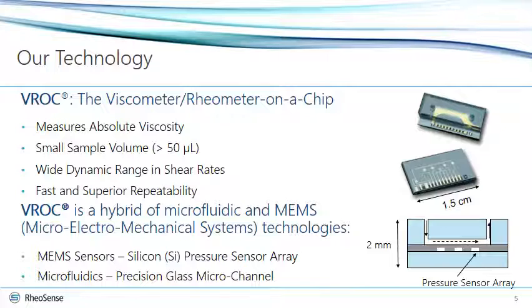Measuring shear viscosity becomes tricky because shear rate is only well defined for a few geometries, such as cone plate, parallel plate, circular slit, and rectangular slit. If you're outside these geometries, you are not going to be able to establish shear rate accurately. And what you will get is what we commonly refer to as apparent viscosity or index viscosity, which is useful to compare the viscosity of several fluids or to order them or index them, but not to establish the true property of the material.